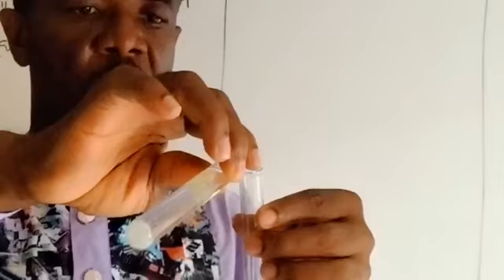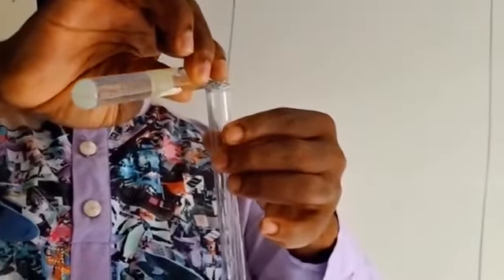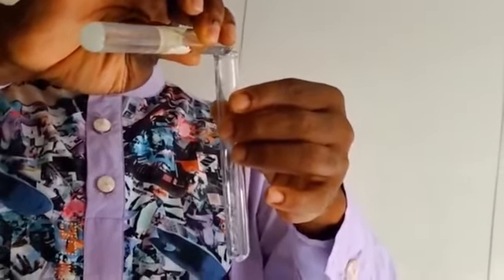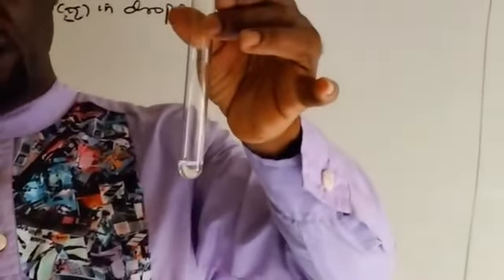So we'll now collect 2 cm cube. We have little amount. This is the C aqueous, C dissolved in water. We'll collect little amount of it. That represents our 2 cm cube into a clean test tube. That's okay. That represents our 2 cm cube of C aqueous.